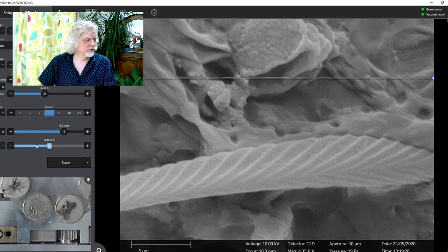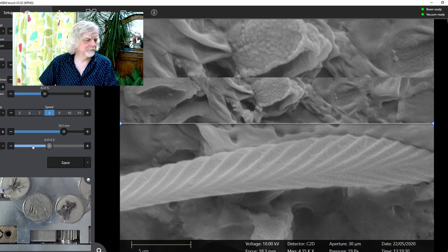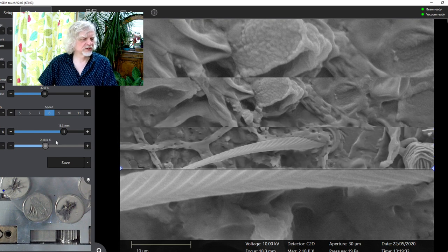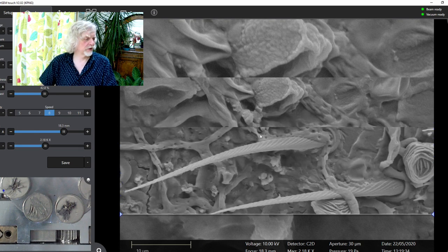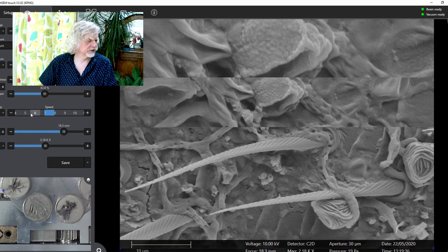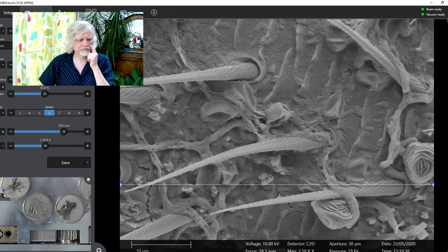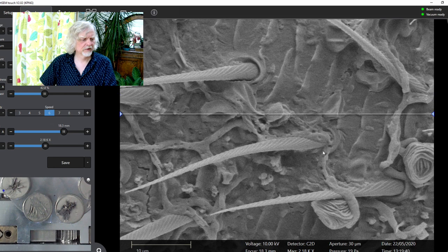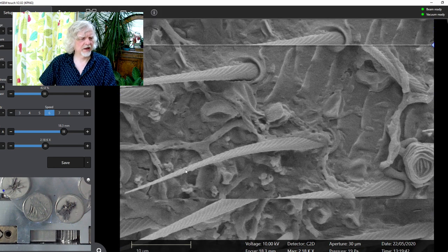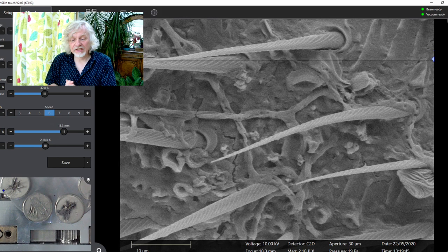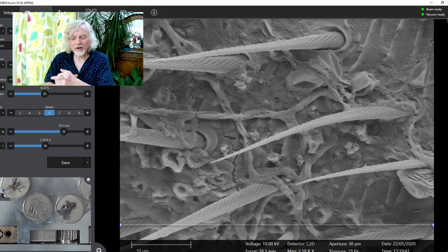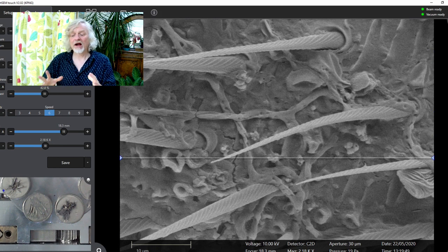Let's zoom out a little bit. A couple more just so we can see a little bit more of what's going on. And I'll turn the speed up a bit so that we don't need to go quite that slowly. That's all I really wanted to say today. Just show you a little bit more on the scanning electron microscope.